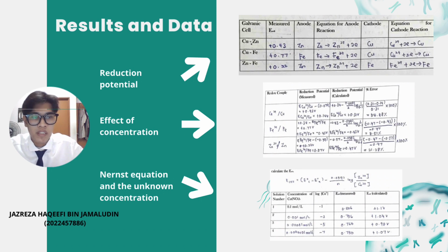and here the error percentage is only 8.51%. And for the last one, which is zinc, this also has a difference, but only a slight one: the measured one is 0.57, but our calculated one is 0.47. That gives us a percentage error of about 21.28% only.